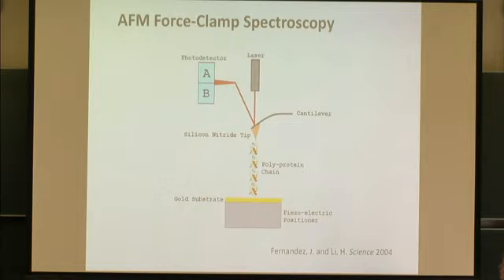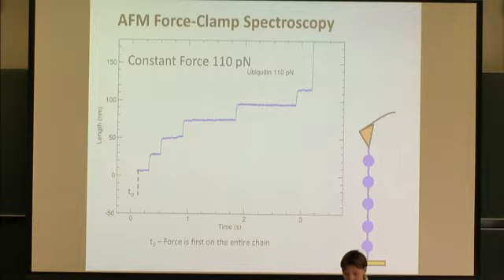And so you use a piezo and a cantilever to essentially pull on these molecules, and you can apply either constant force or constant velocity and measure the end-to-end length of this protein. The downside of the experiment as compared to MD simulations is that you have only one single reaction coordinate. You're fairly poor in your data, but you can measure what happens over time.